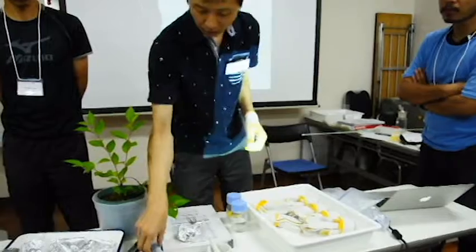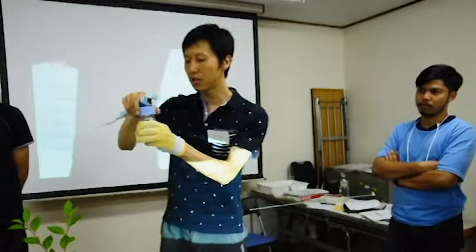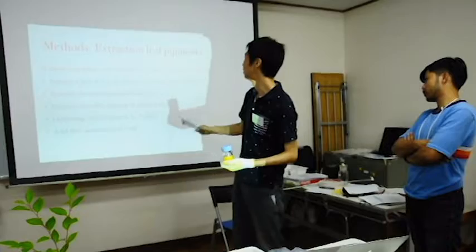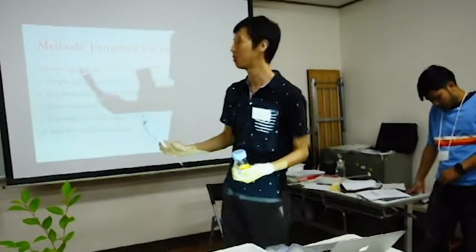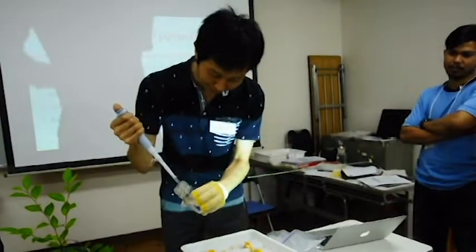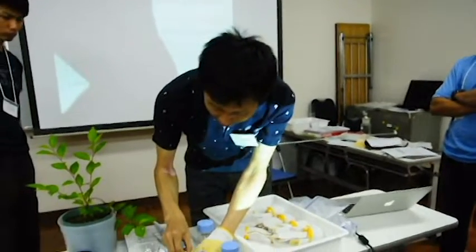And so after crushing, please add these 80% acetone. This acetone is an organic solvent. Do you know organic solvent? Don't breathe this vapor too much. It's not good for your body. But the smell was so good. Add milliliters, and mix well.